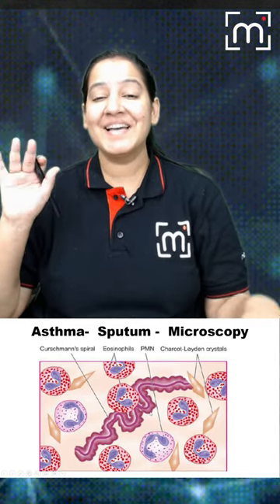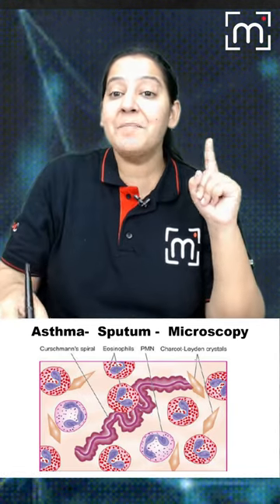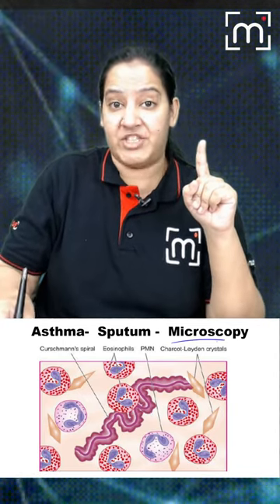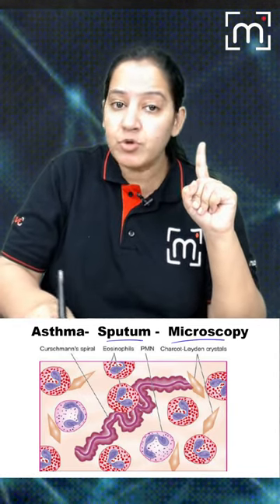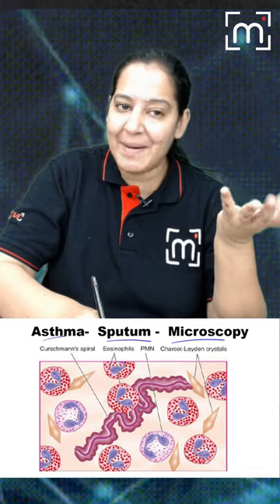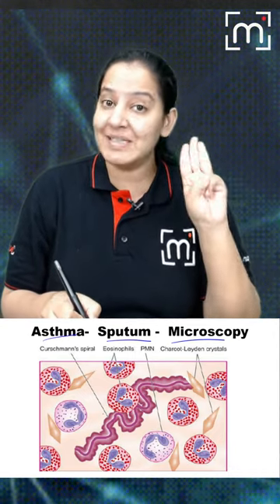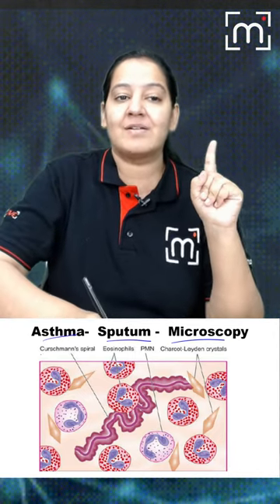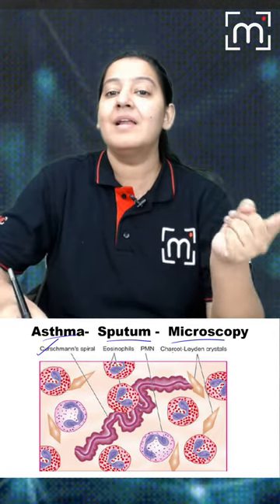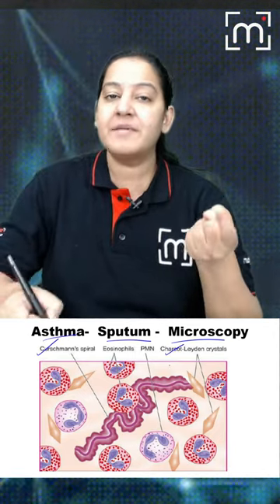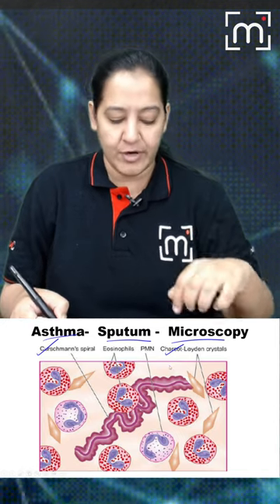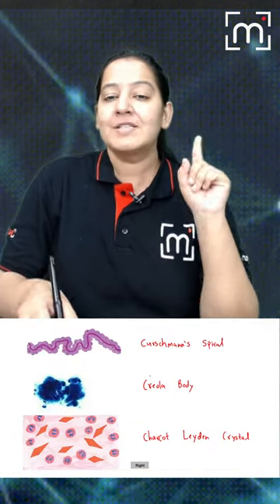Hi friends, here you can see the microscopic picture of sputum of an asthmatic patient. You can recognize the three C's: the Curschmann's spiral, Charcot-Leyden crystals, and creola bodies.